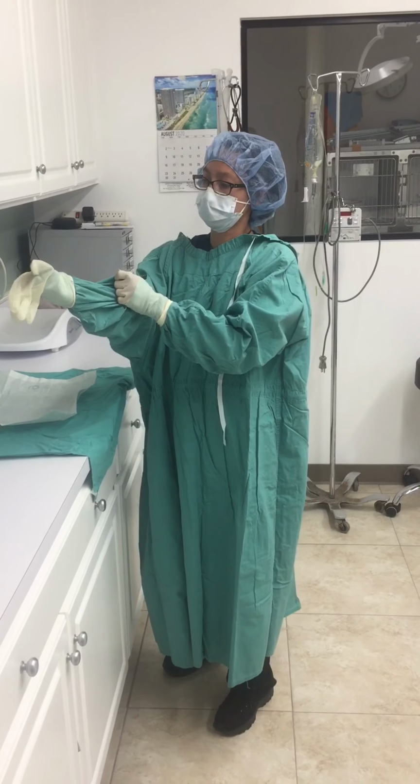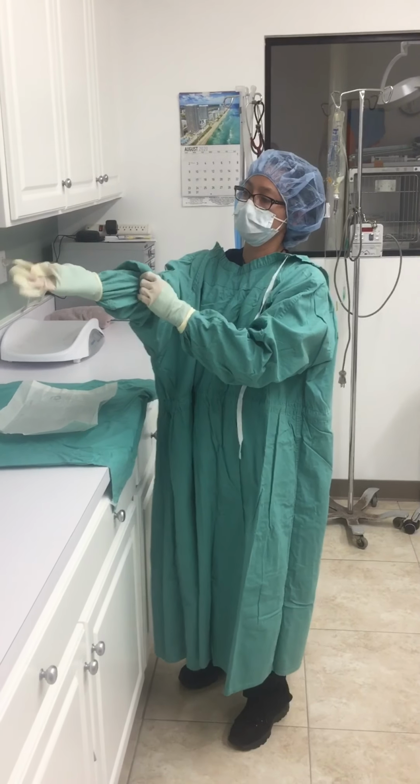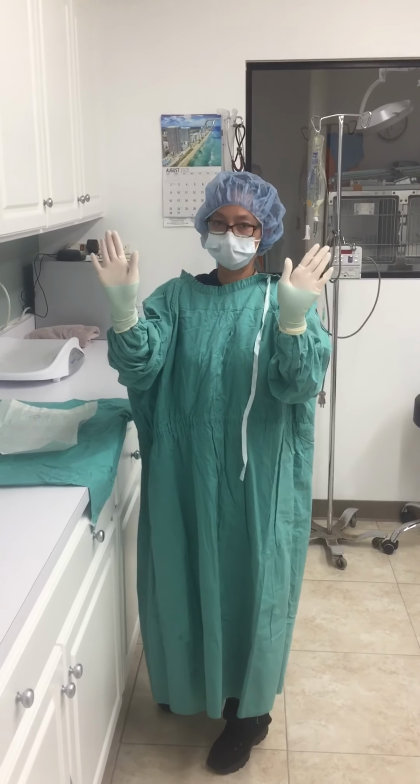Then you're going to grab your cuff here. Remember, this is sterile, and it should slide. This one went on a little bit easier. There we are, and we are sterile. We are ready for surgical anesthesia.